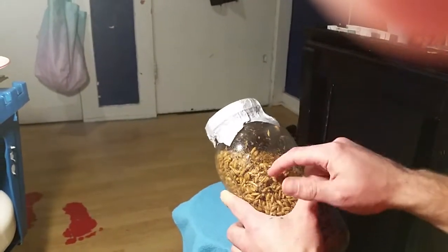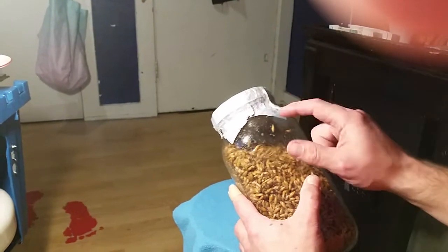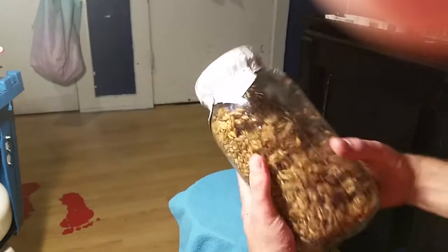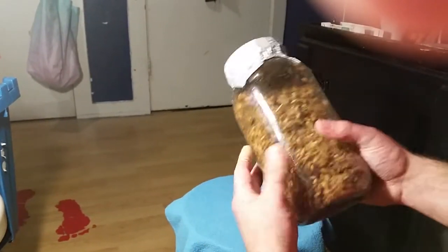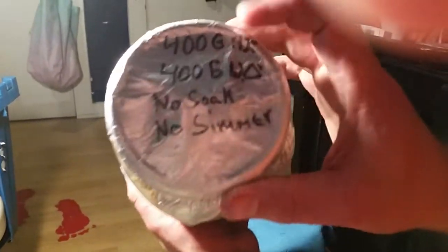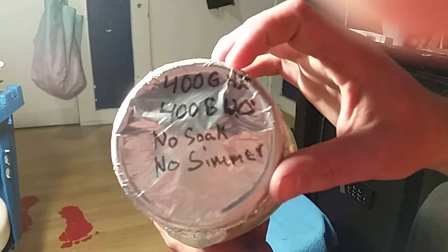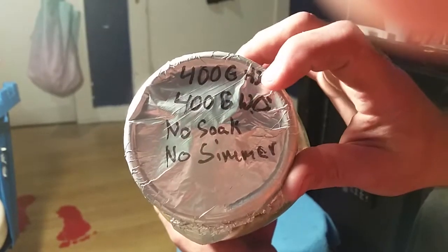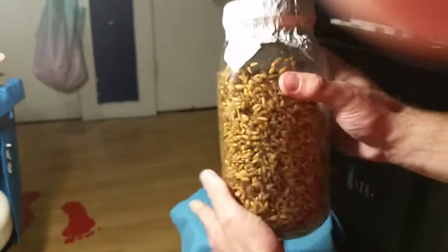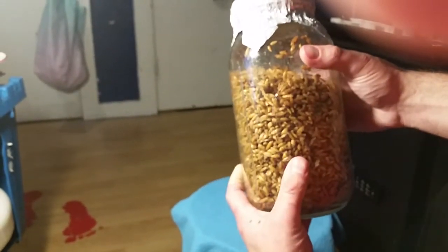This is whole oats with the hull still on it — a very non-starchy hull. I thought rye was the be-all end-all, but this stuff seems to be the best. I added 400 grams of water and 400 grams of whole oats, didn't soak it, didn't simmer it, just loaded the jar with the water and grain and pressure cooked it.